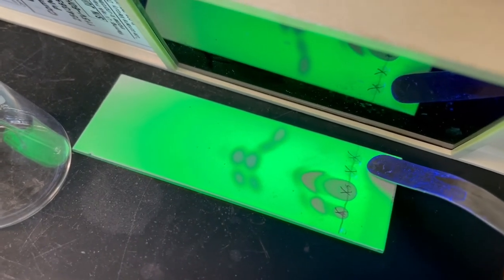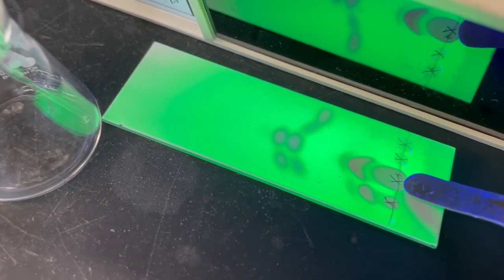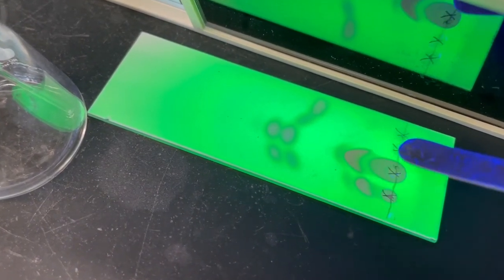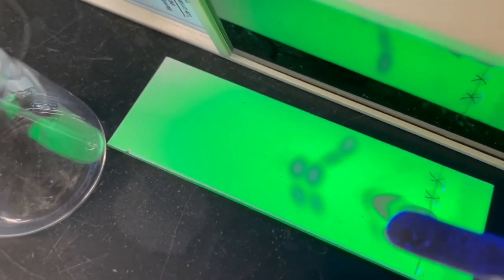They were both a white crystalline material. What we see here is a little bit of streaking. It's probably just where I spotted the sample before it starts separating. So this right here and this right here should be triphenylphosphine oxide. Notice it's not present in the products because it washed away and is in the filtrate only.